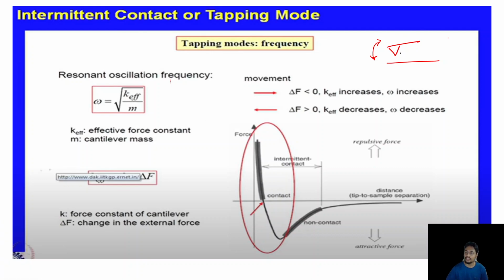So due to vibration, it is vibrating like this. Sometimes it is touching this, and the other position is like this. So it is always vibrating or oscillating at this frequency. Sometimes it touches, but it does not touch for long. As it touches, obviously there will be some kind of change in the frequency or some kind of change in the amplitude. But as it touches sometimes, the resolution will be much higher.